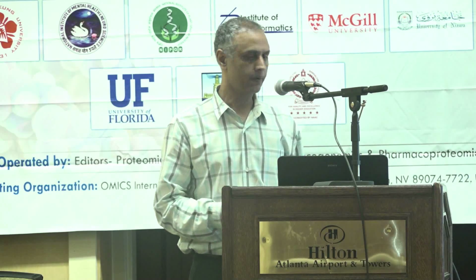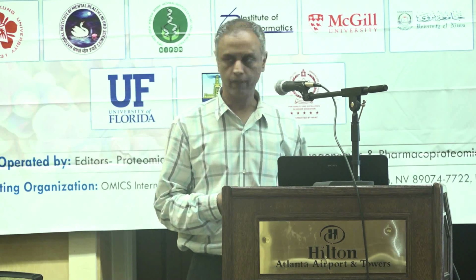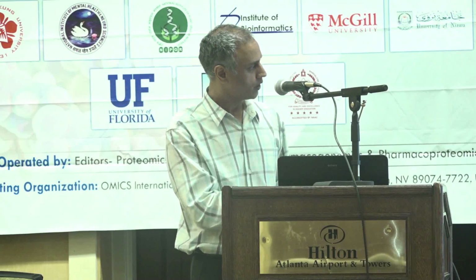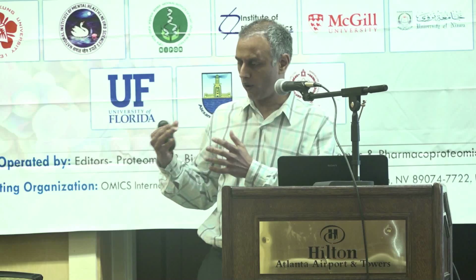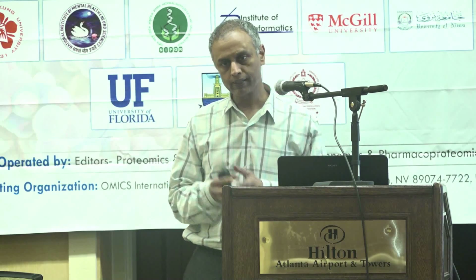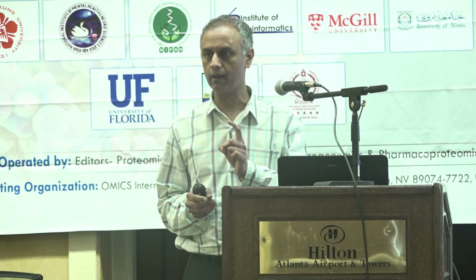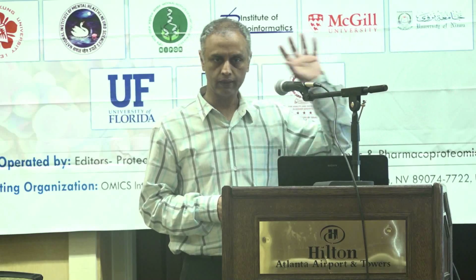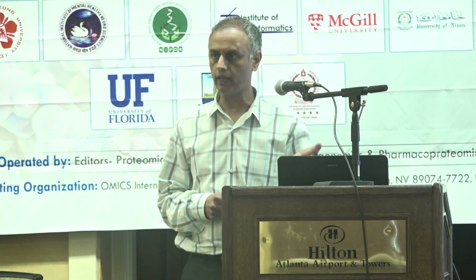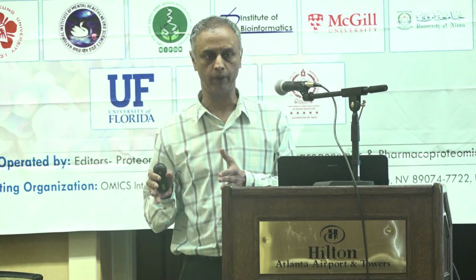So what we have done is we have taken these cultures, we have digested them into peptides, and then we have sequenced them. Often when we are looking at cancer proteomes or tissue proteomes, we are running 50 to 60 different runs from one sample. Here, we are running the entire proteome as a single run, and I'll tell you, we are also running that for a short time. So it's the biggest shortcut we could ever take in proteomics.